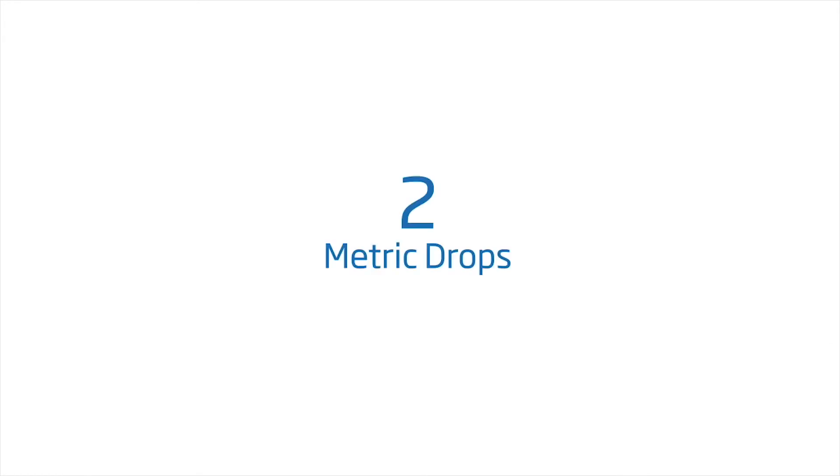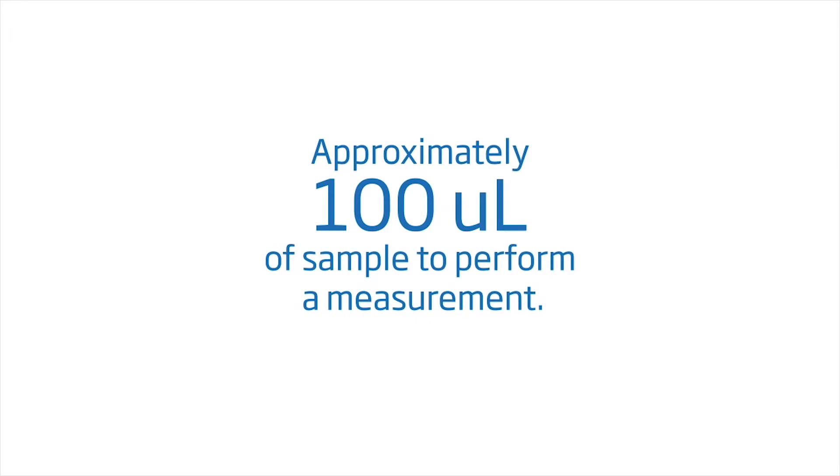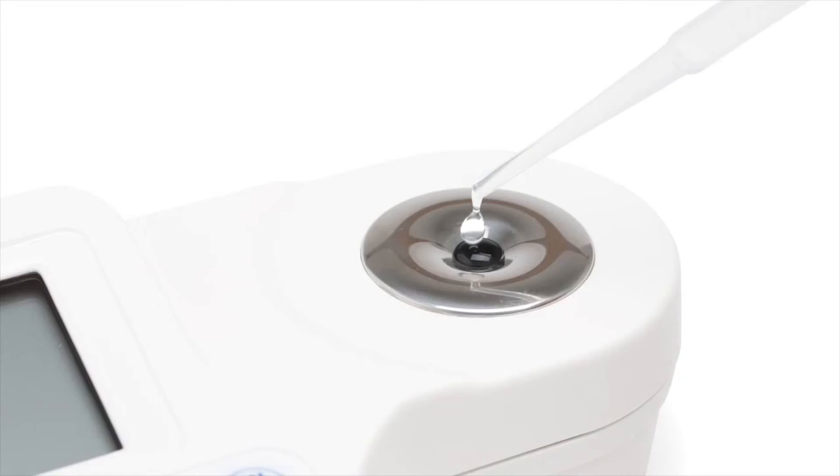The HI-96800 needs only two metric drops — approximately 100 microliters of sample — to perform a measurement. To take a measurement, use the pipette to place the sample on the well and press Read.